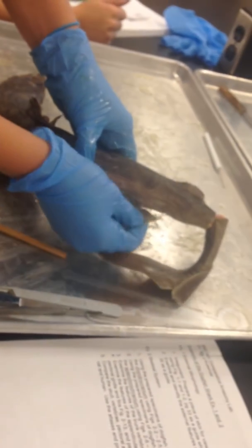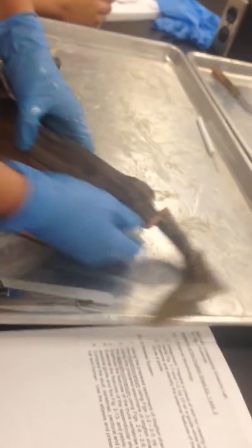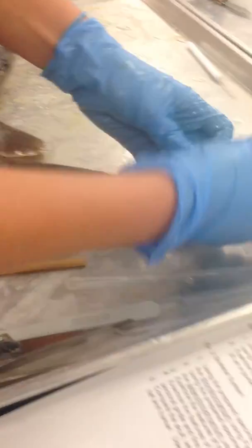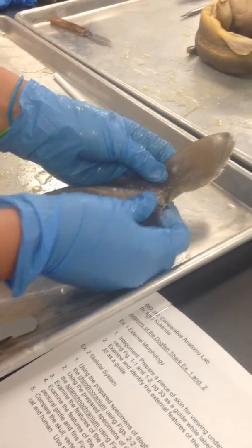These are the pectoral fins. These are the pelvic fins, and up here — a little broken — is the posterior dorsal fin, and back here is the caudal fin.